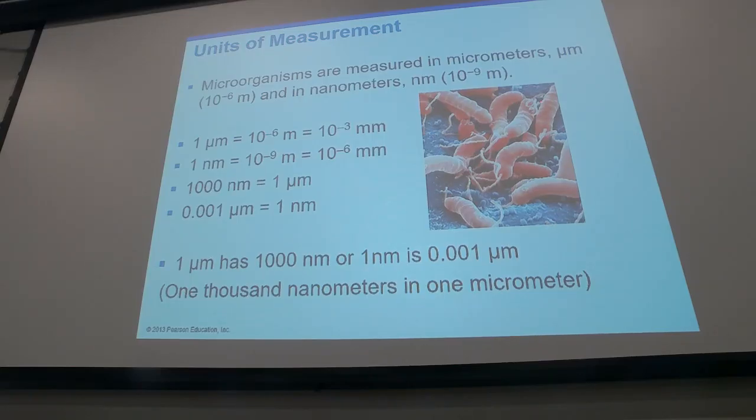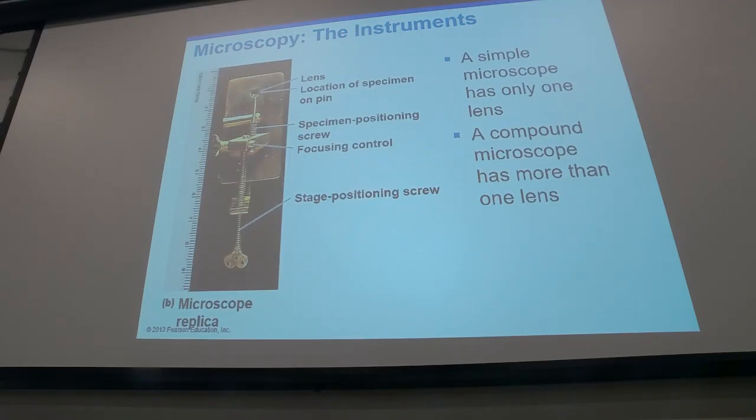And something that you can see here is a scanning electron micrograph of this curved-shaped bacteria with an extension that is called flagella. So maybe someone will be measuring the diameter of the flagella or at the tip of the flagella, and maybe it would be 1 nanometer, which is 0.001 micrometers, or 10 to the minus 3.